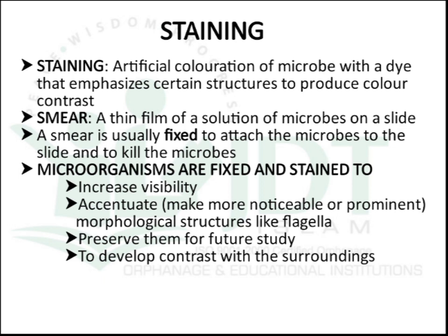The smear is usually fixed to attach the microorganism to the slide and to kill the microbes. And the microorganisms are fixed and stained to increase their visibility, to make the morphological structures like flagellae more noticeable, to preserve them for future study, and to develop contrast with the surroundings. So these are the reasons for fixing as well as staining.